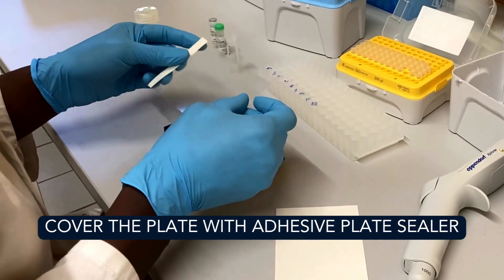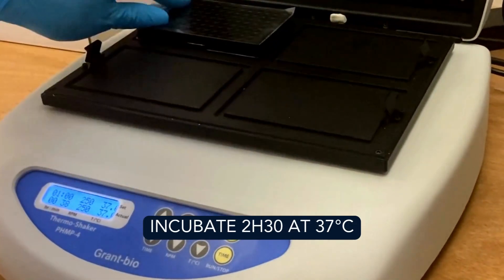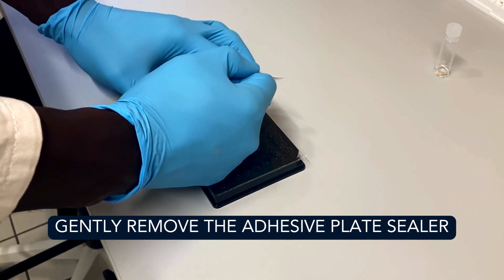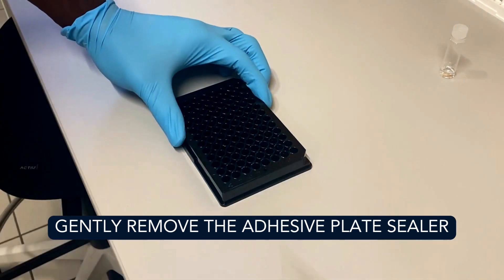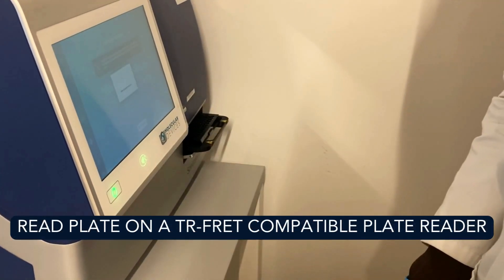Cover the plate with an adhesive plate sealer and incubate for two hours and a half at 37 degrees Celsius. After the incubation time, gently remove the adhesive plate sealer and read the plate on a TR-FRET or HTRF compatible microplate reader.